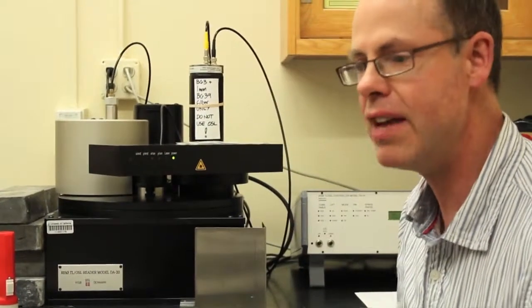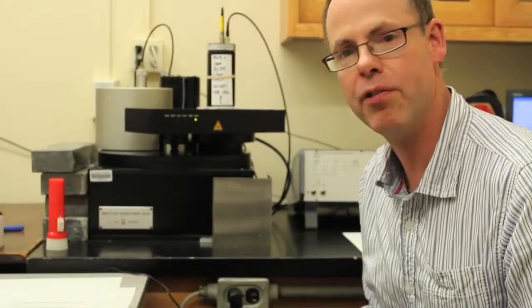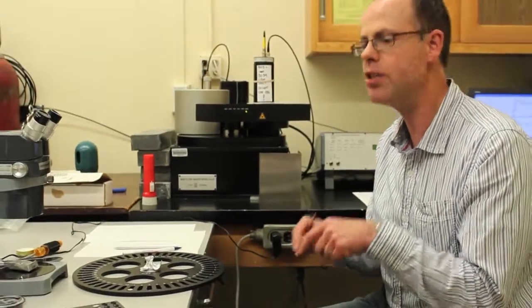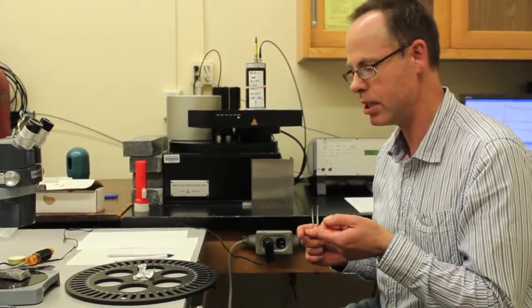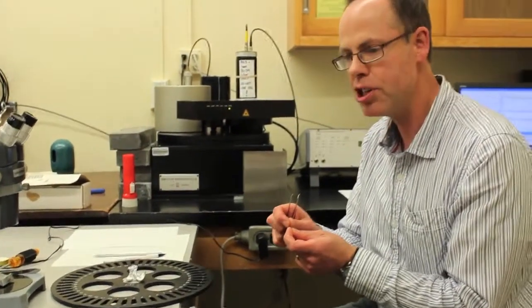So we're currently doing infrared stimulated luminescence. The light that we're shining on the sample is infrared light. It's stimulating electrons to become untrapped. They're actually grains of feldspar that are in the machine at the moment, and they're recombining within the grain itself to produce a blue and ultraviolet signal that we're collecting.